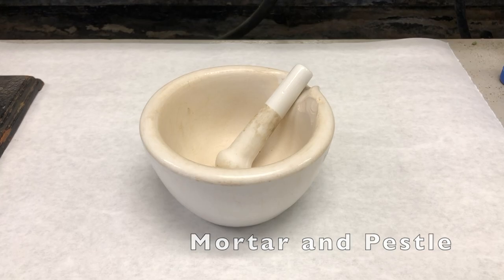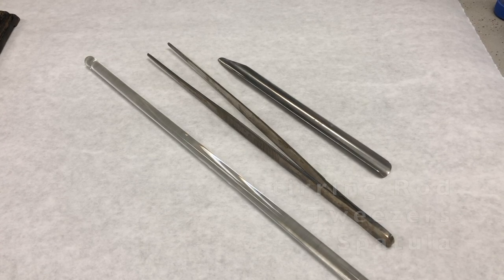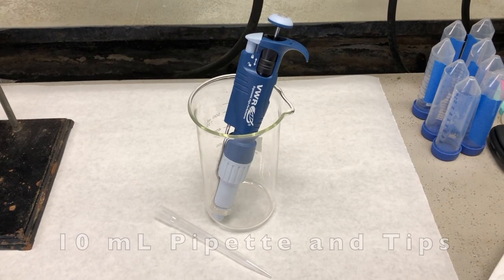You will also need a small mortar and pestle, a glass stirring rod, long tweezers, a laboratory spatula, an aluminum weighing dish, and a 10-milliliter pipette with tips.